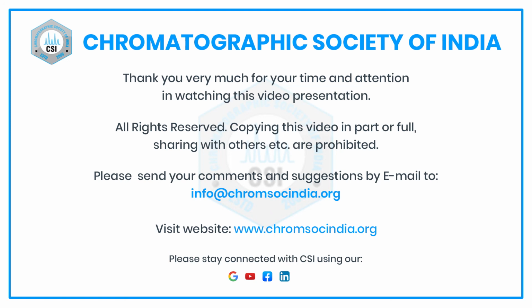So whatever you need to do, whether protonation or deprotonation, you can do with LCMS. You can have LCMS attached to a single quadrupole mass spectrometer or a triple quadrupole mass spectrometer, and so on. But right now, single quad is the minimum that you need for LCMS to work, and then you can go to triple quadrupole or any hybrid mass spectrometers.